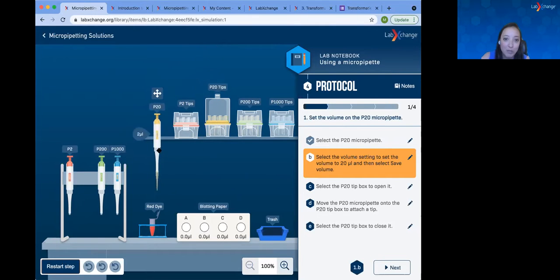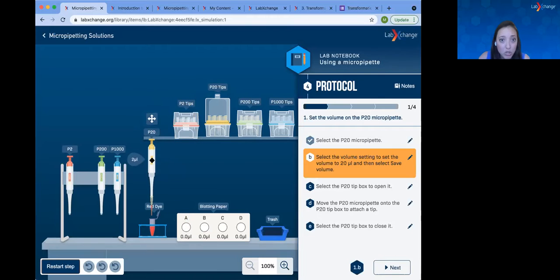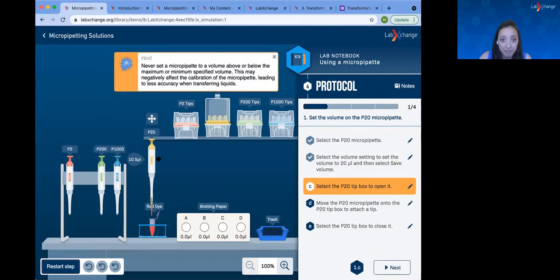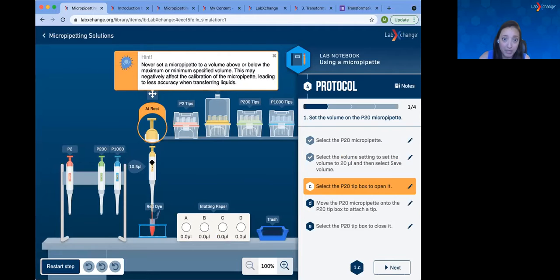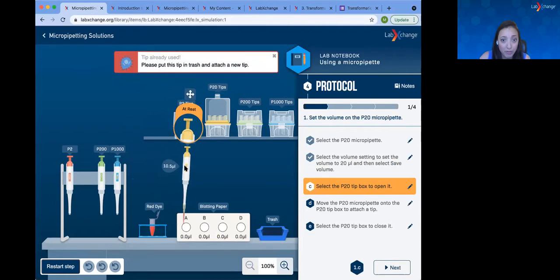Now this one is just moving dye around, so there's not a lot of things that can like go wrong. They could run out of dye, or you'll see if I'm measuring the wrong volume in the wrong place. It does keep track of that. It doesn't force me to do it the right way. And you can go through and change all the volumes that you want, measure it. So here, did I exceed? Not yet. Okay. You can measure the volume of liquid.